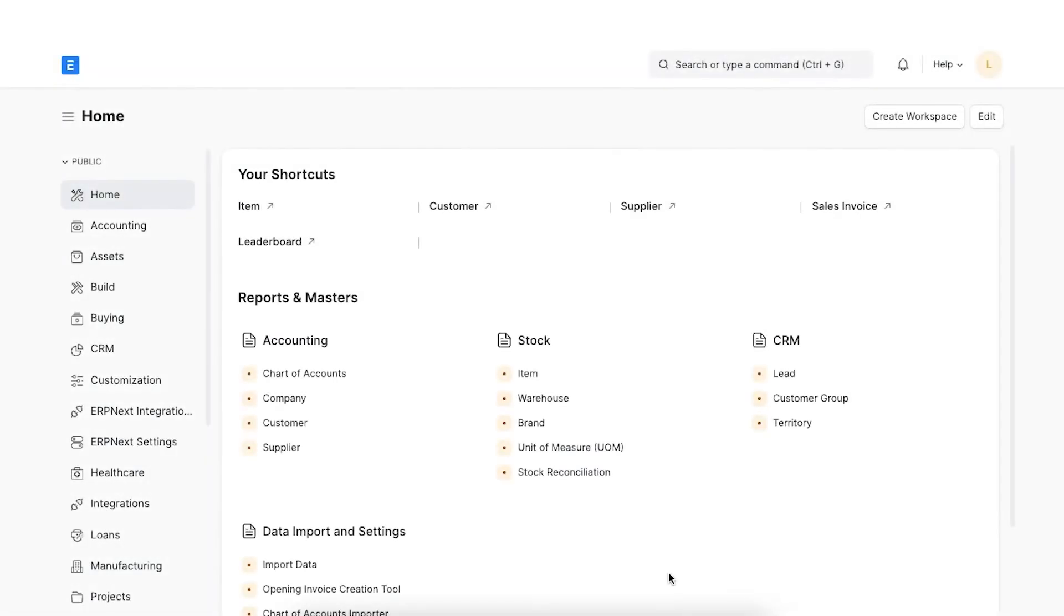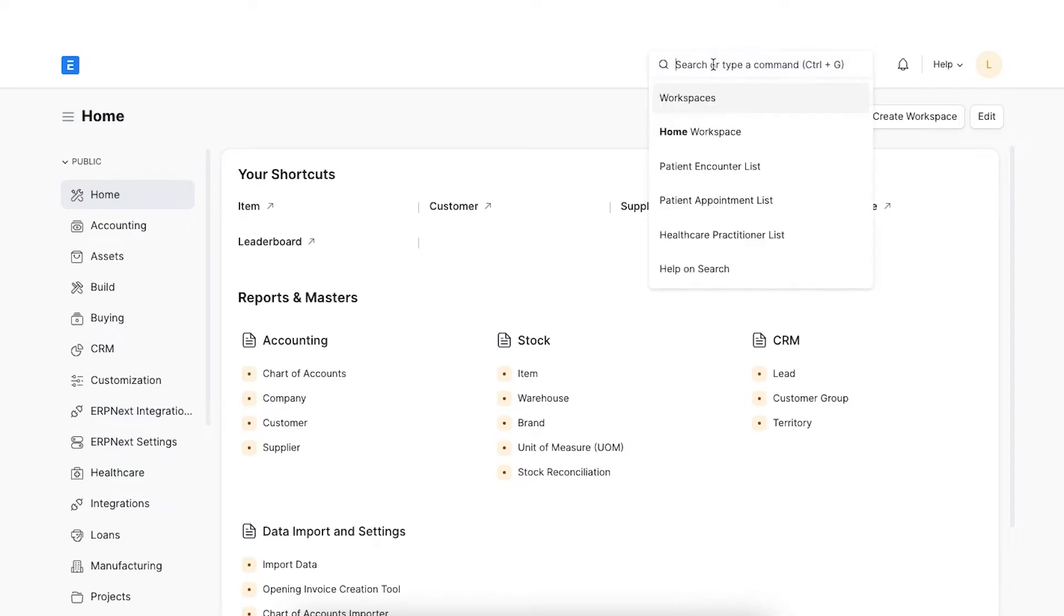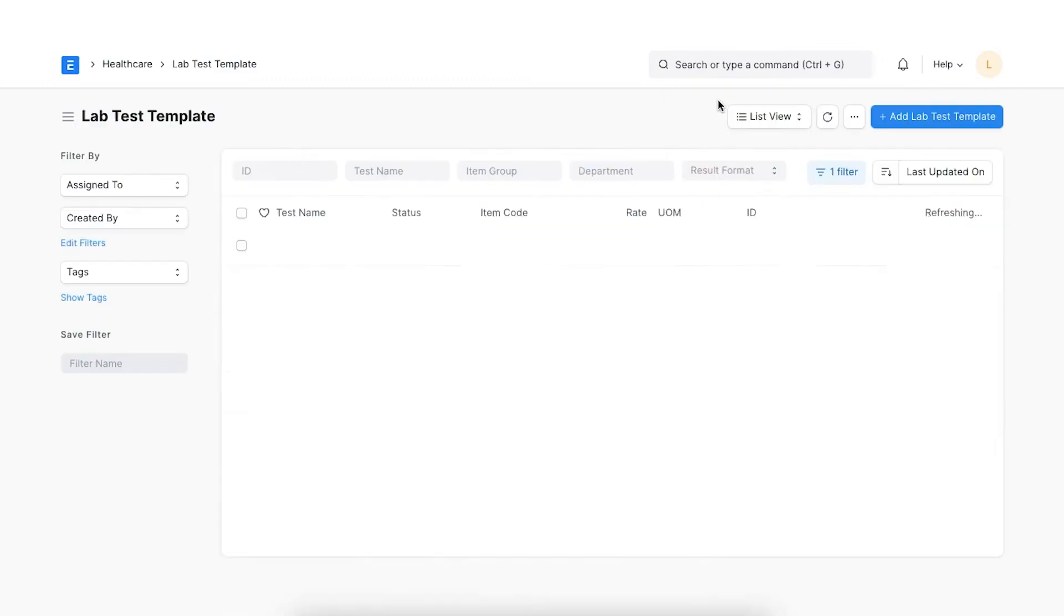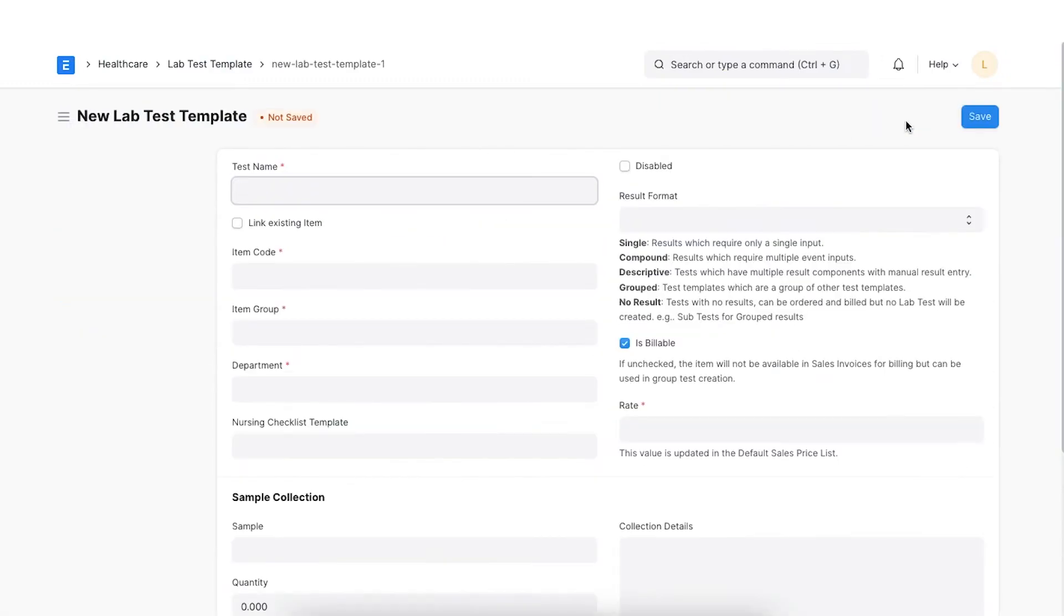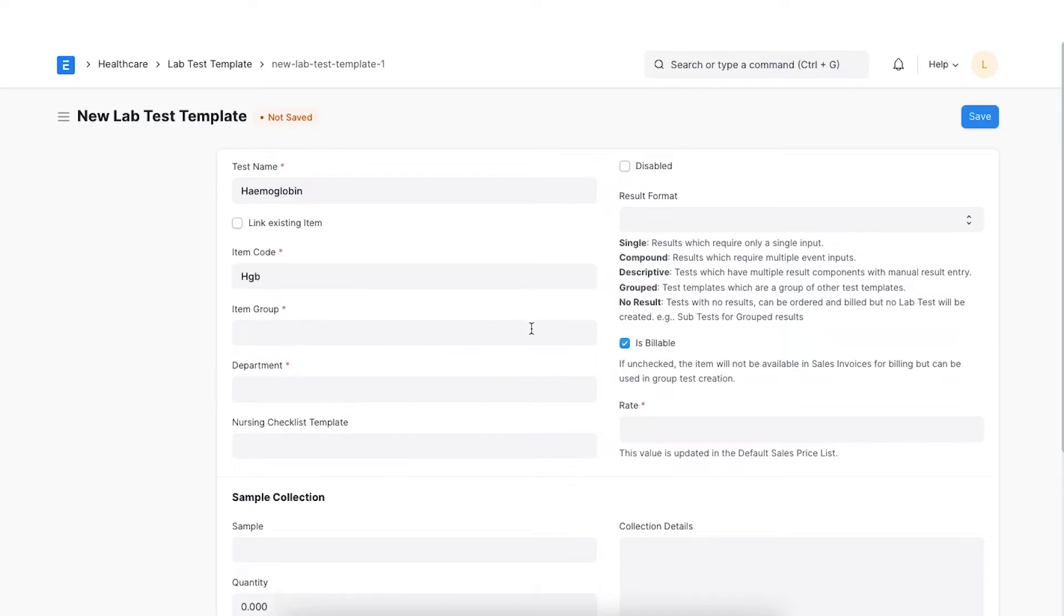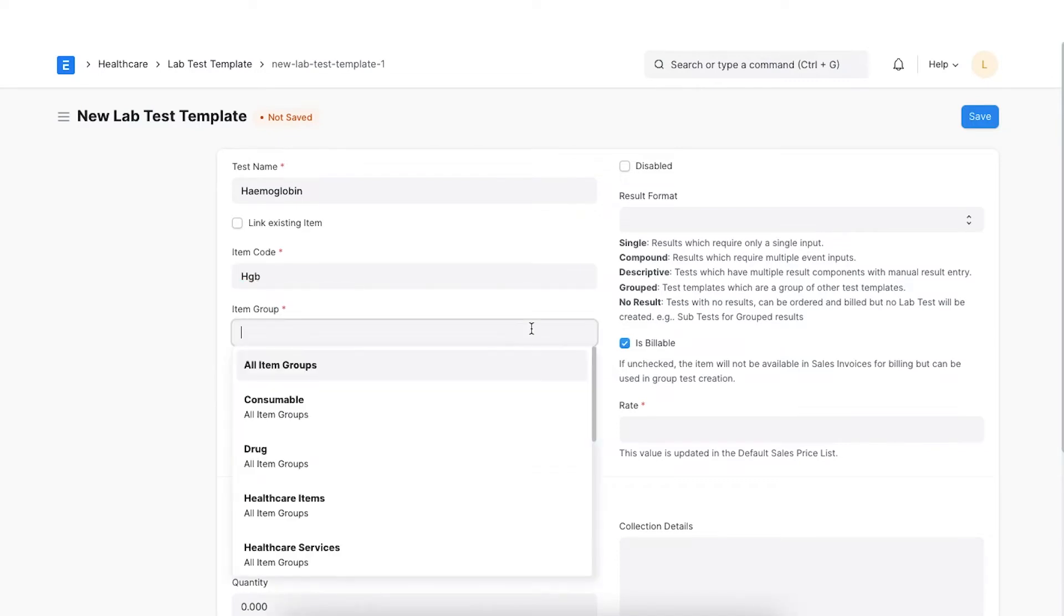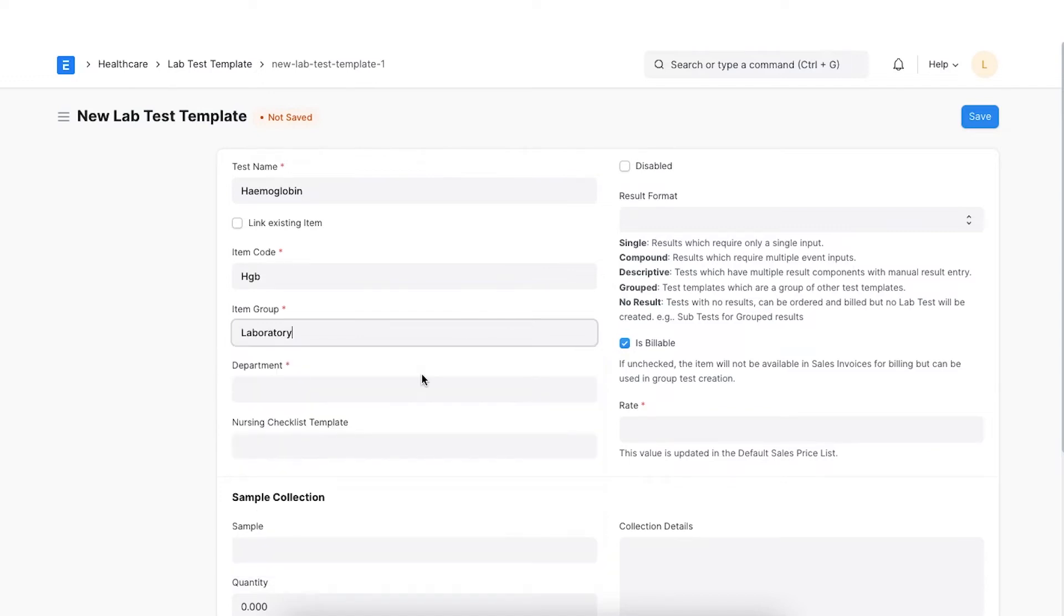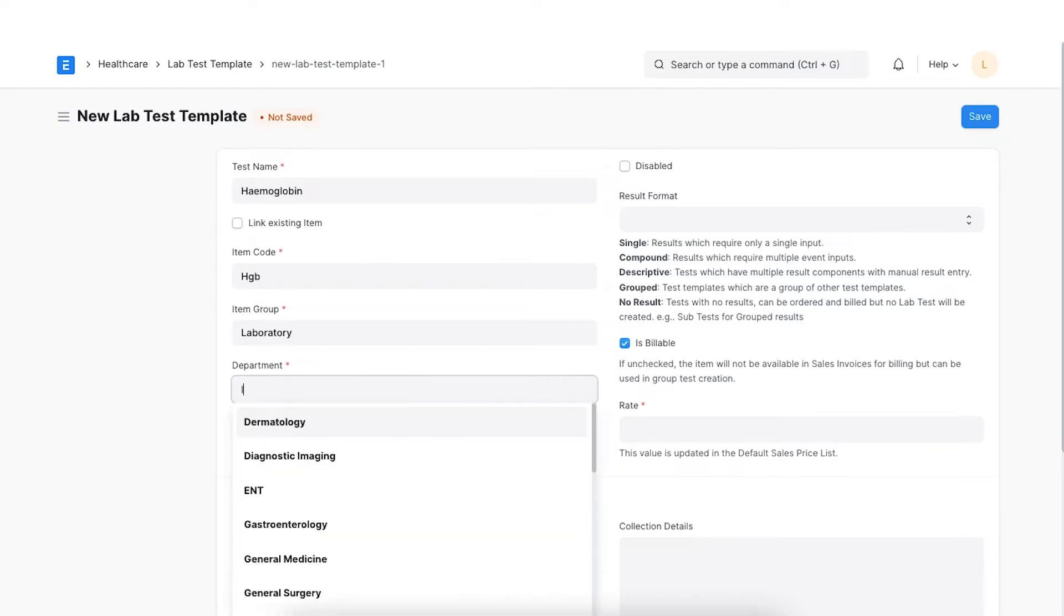Lab Test Template allows us to create all types of lab tests rapidly. We can pre-configure the events and results for varied tests, so that we don't have to fill in redundant data every single time. Let's create a lab test template. Navigate to the lab test template and click on New Lab Test Template. Specify the name of the lab test. Items are created automatically on template creation for managing the billing workflow of lab tests. A default item code will be generated which we can change if required. We can group the lab tests based on different criteria using this field. We can either create an item group or choose from the existing ones. Select the medical department for which this lab test is conducted.